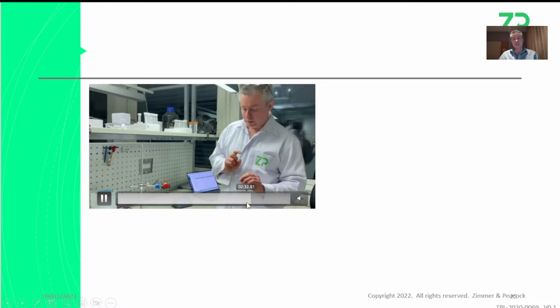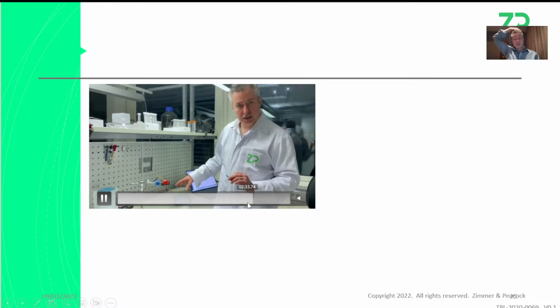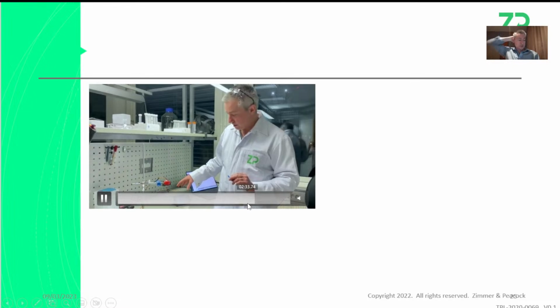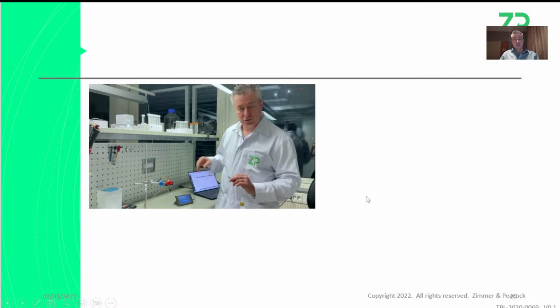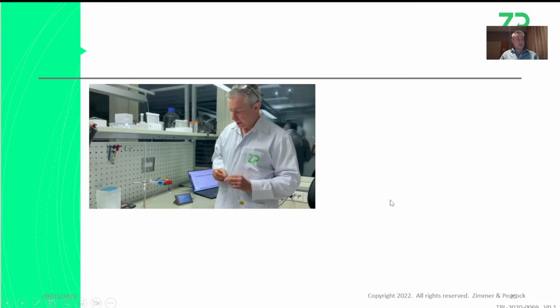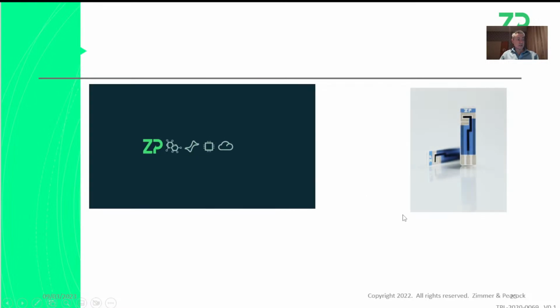It's nice because it's got a potentiometric mode, which is what you need for ORP, but it also has impedance spectroscopy, which will answer one of the next questions, which is really about the change in conductivity or salinity in that solution.